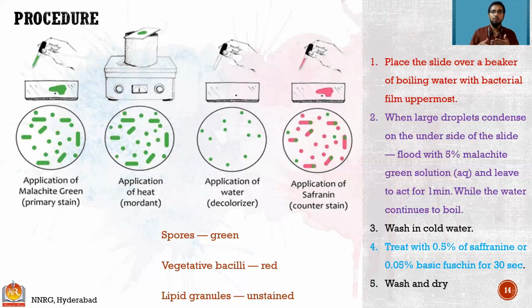If we have something very important, we won't let others take it. Similarly, spores, once they have imparted a certain color, won't let it go away, and won't let other colors bind to them. Okay, you can see the procedure on the right.